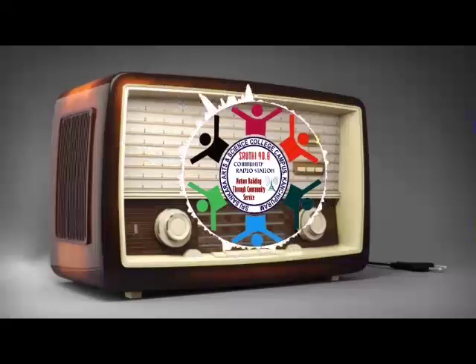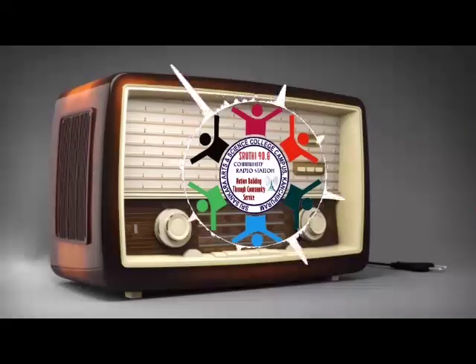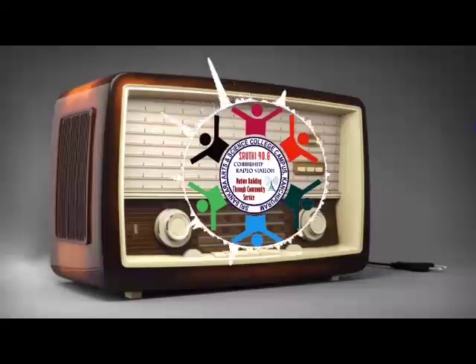There are two types of spargers. One is the orifice sparger. The second one is the nozzle sparger. In an orifice sparger, there are many holes or drills on the under surface of the tube, making many rings or cracks. But in the case of a nozzle sparger, it has a single hole. The air is supplied through a single hole of the sparger in the center of the bioreactor.